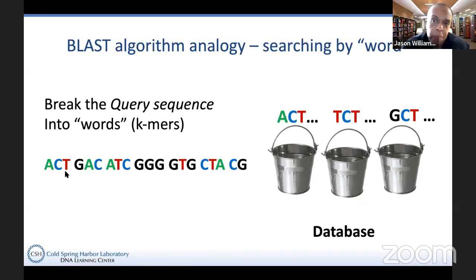And then also, more importantly, and I think you can understand this, is that biology is messy, right? If I were to search for a human DNA sequence, you and I are different, right? So we have to be able to accommodate that there may be mutations in sequences or possibly sequencing errors, and we need a search that is still robust to that. So you need to be able to search.